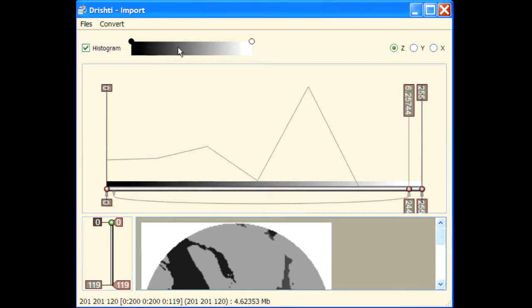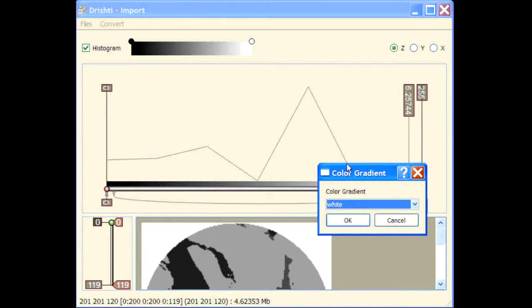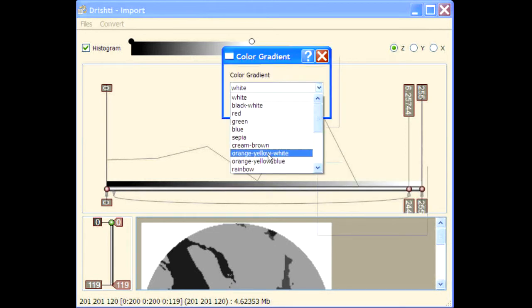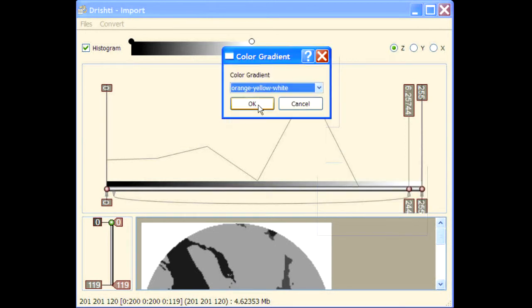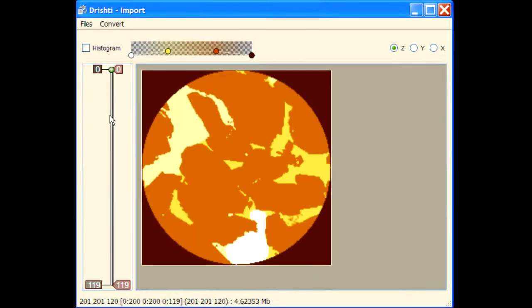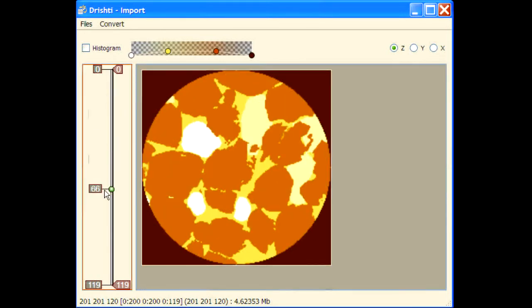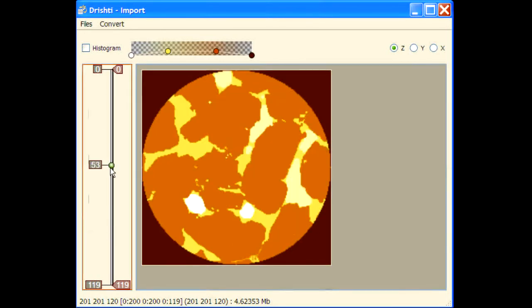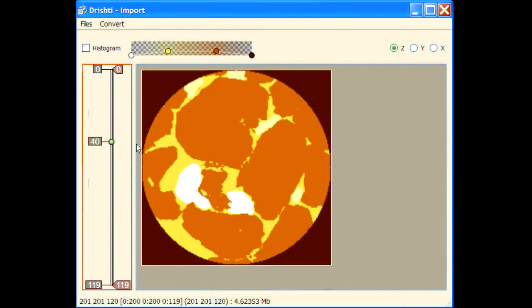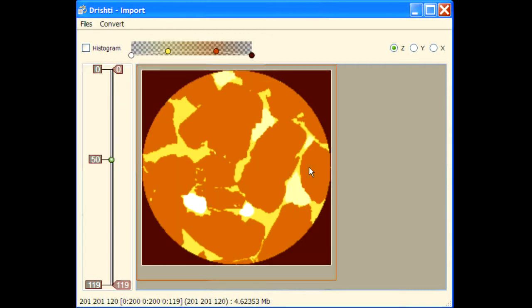Hover over this color and press space bar and you will get a different color gradient. So you can apply color gradient and these are your different phases.